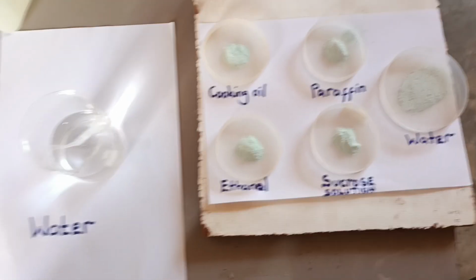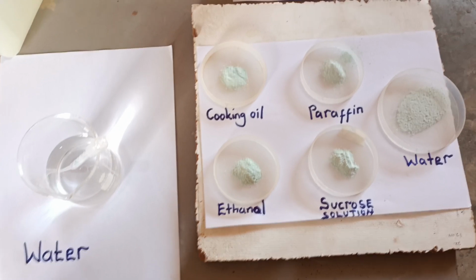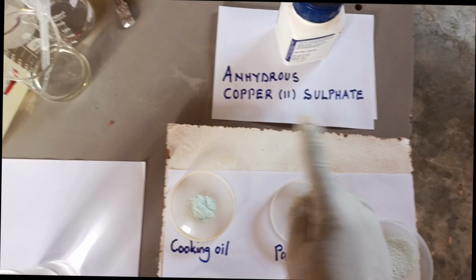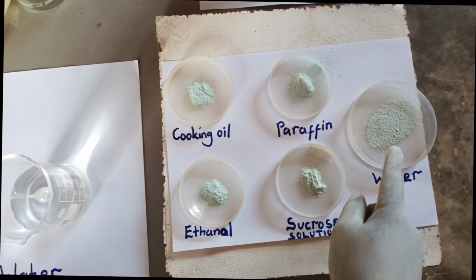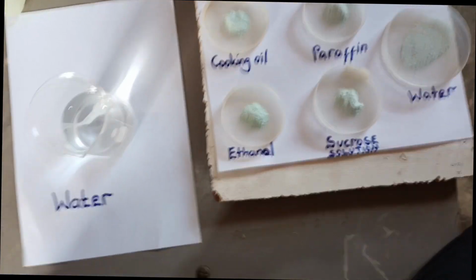Hello chemists, today we are going to learn how to detect the presence of water in different liquids. The presence of water in the laboratory is detected by use of anhydrous copper 2 sulfate. It is white in color, and when you add any liquid on it that contains water, it turns to blue.